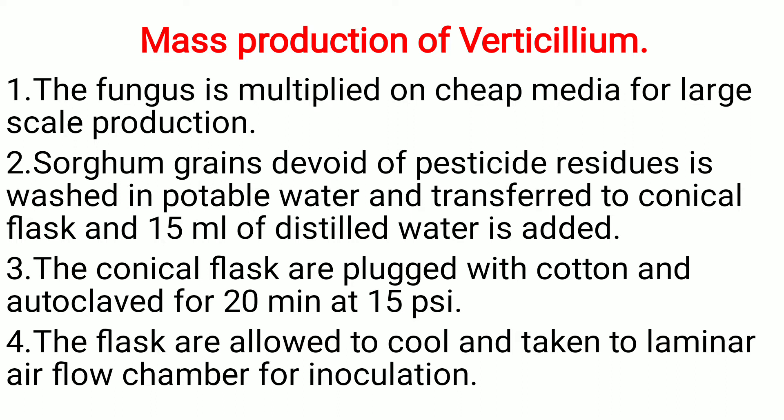Sorghum grains, which are free of pesticide residue, are washed in potable water. The sorghum grains are washed and transferred into a conical flask, and 15 ml of distilled water is added. The conical flask is then plugged with cotton and autoclaved for 15 to 20 minutes at 15 psi pressure, so that the sorghum grains get sterilized.